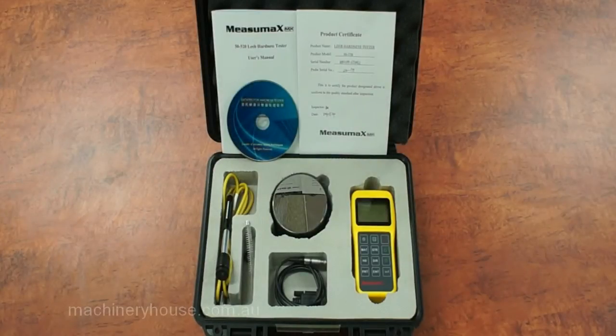This is the MeasureMax Portable Digital Hardness Tester, product code Q520.